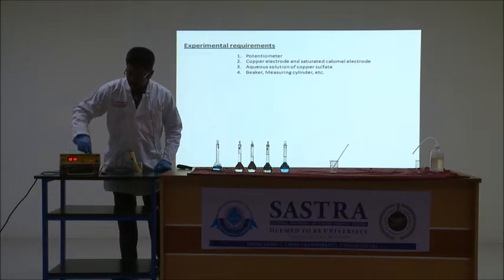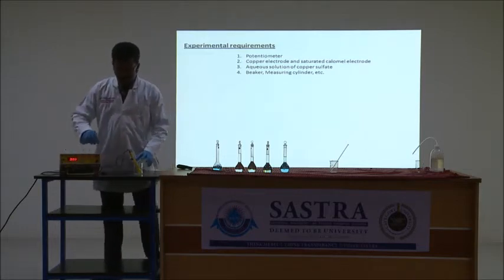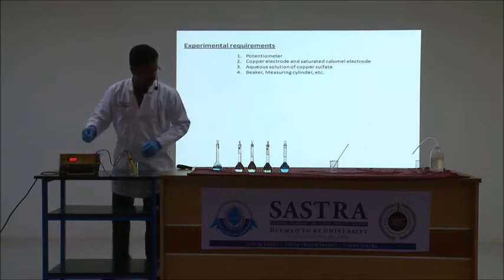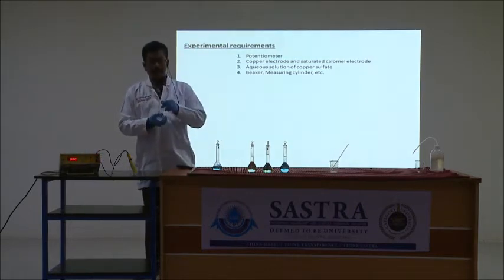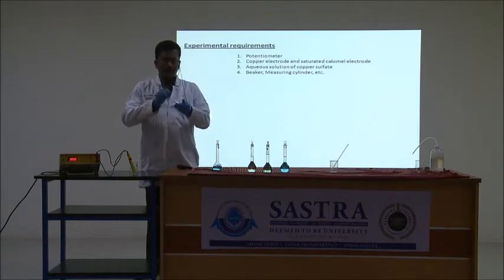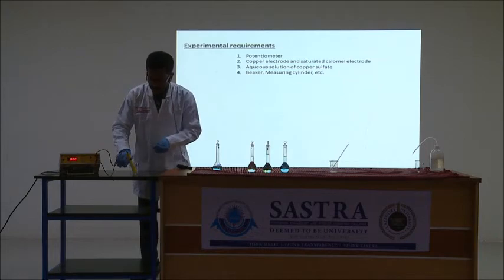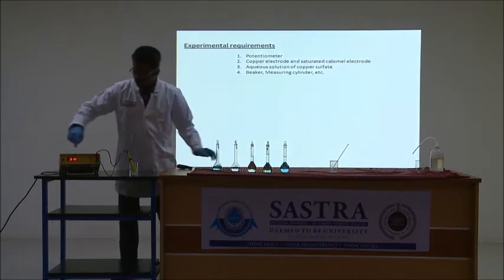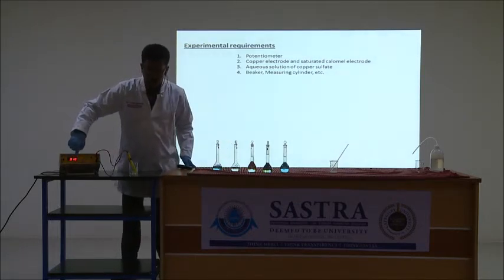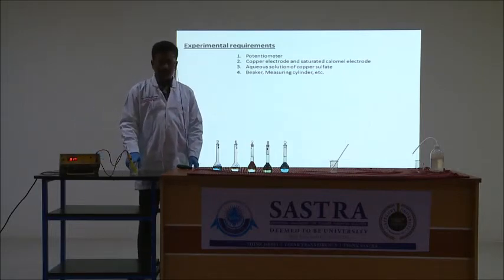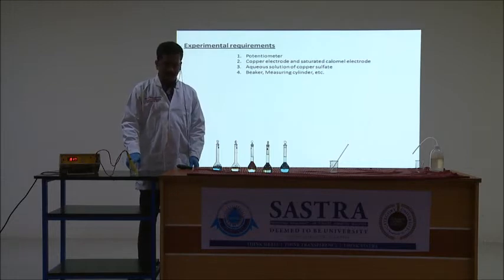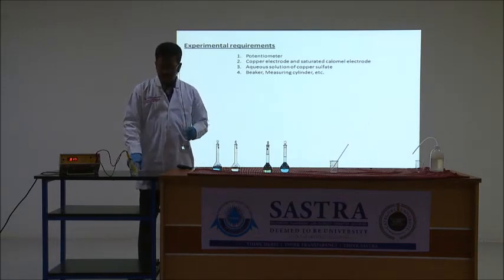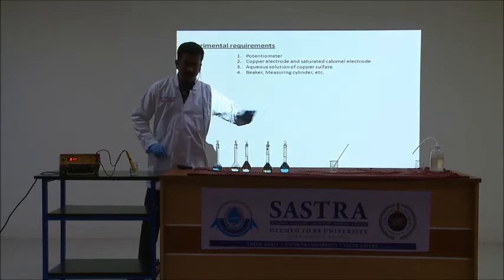Once the instrument is calibrated, change the knob towards read. Now connect both the electrodes with the instrument and add approximately 50 ml of 0.01 molar copper sulfate solution. It shows a potential of 0.018 volts. Once this measurement is completed, discard this solution, wash the beaker and the electrode with distilled water, then take the 0.02 molar solution, rinse the beaker and the electrode, discard the solution, and add 50 ml and measure. Like this, measure all the concentrations.